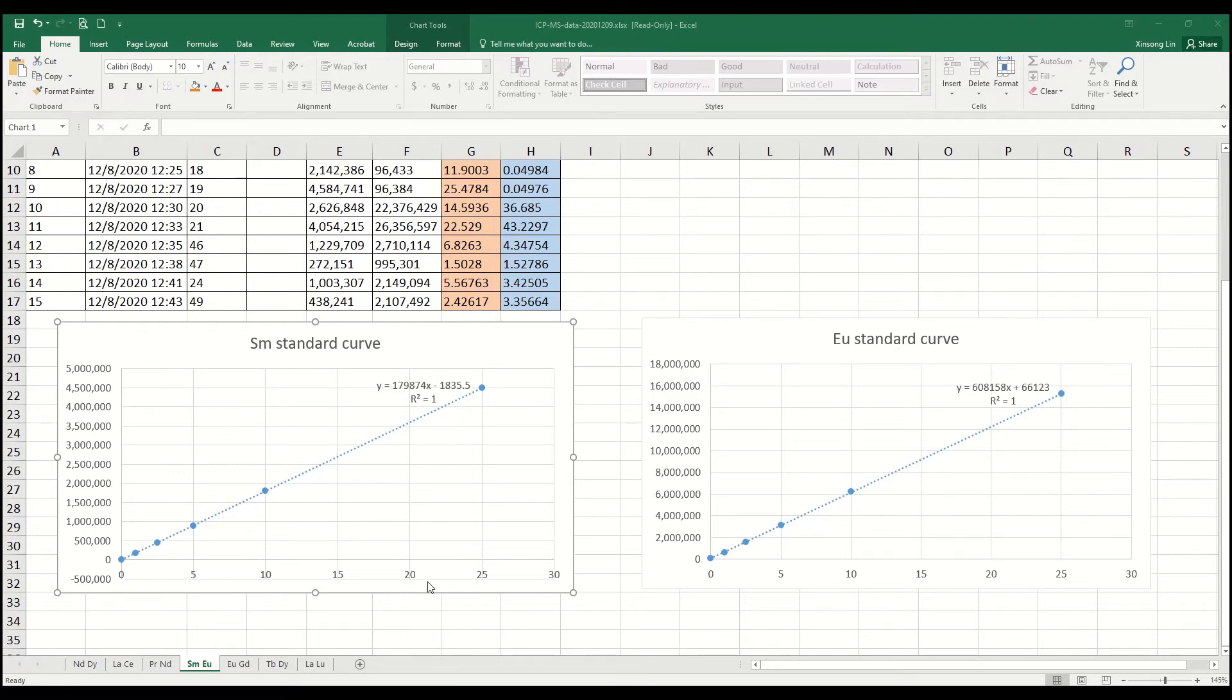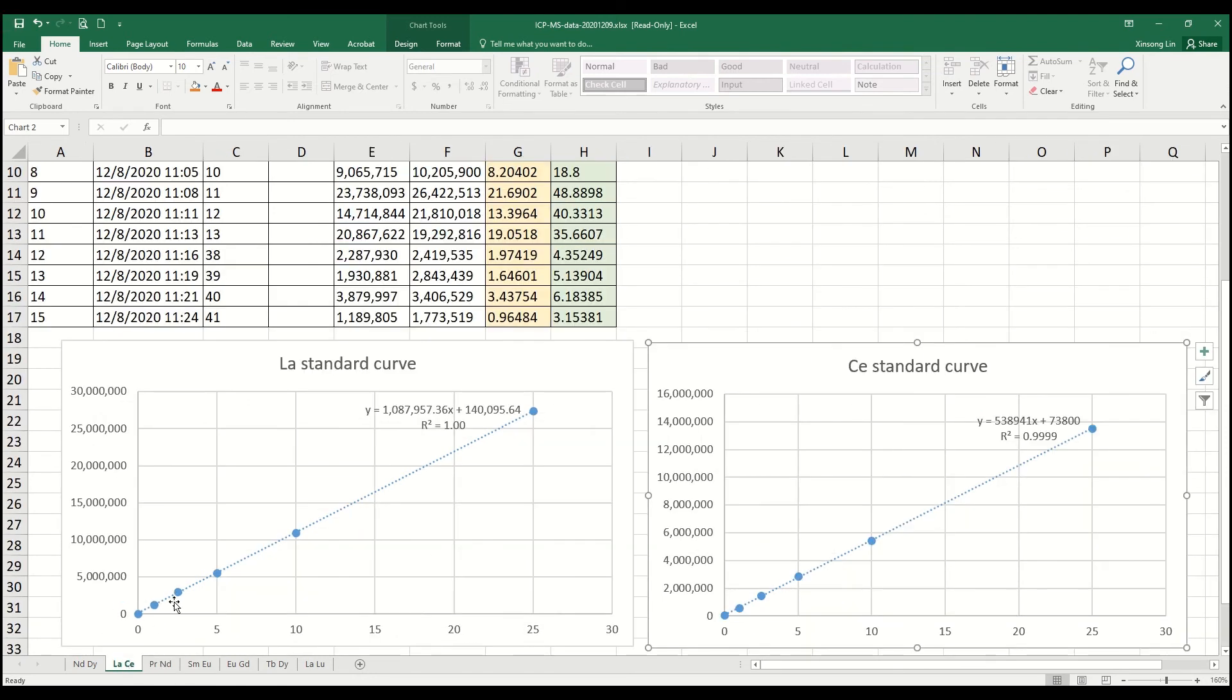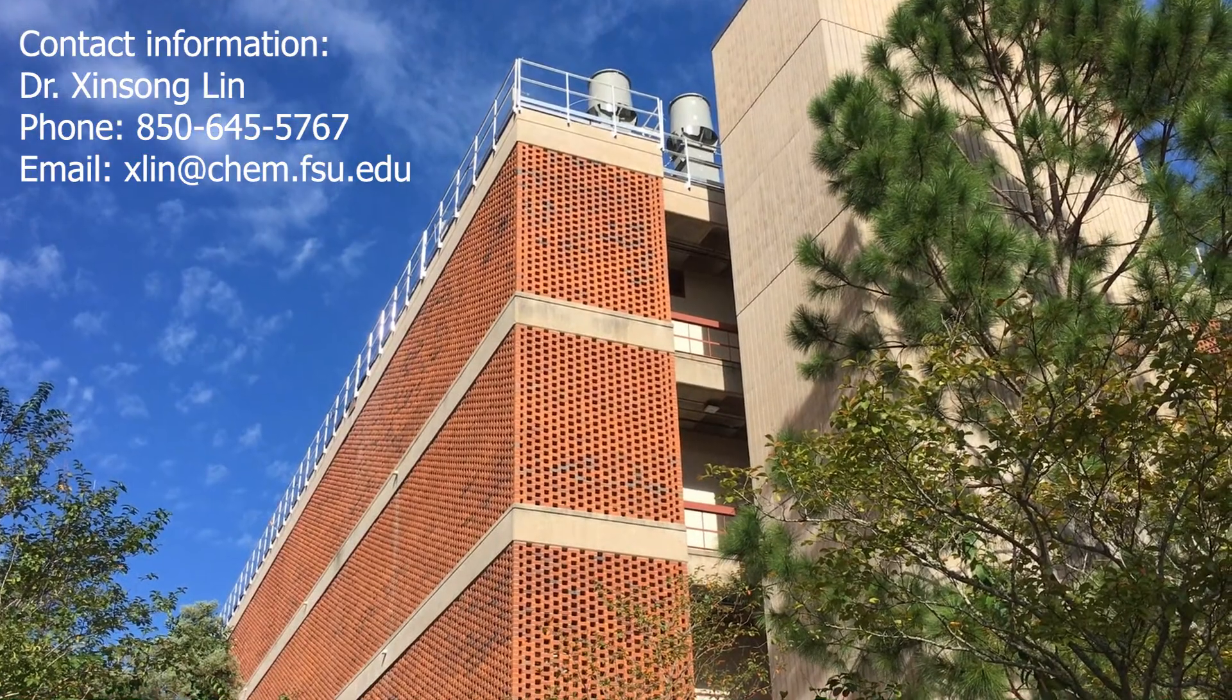Raw ICP-MS data are calibrated to account for interferences and instrument drift. For more details, please feel free to contact the manager anytime.